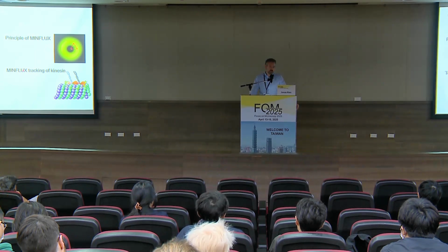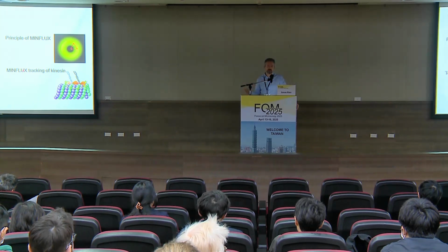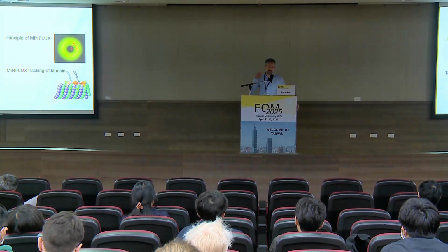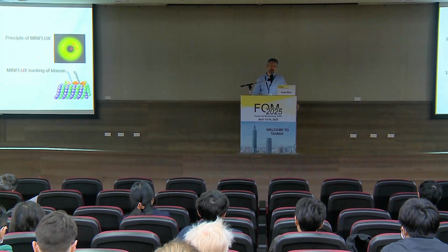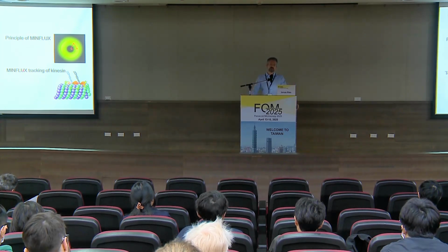Yeah, I think, well, you can try to reduce the flickering. If you don't work in living cells, often the buffer can be changed, or you use a different fluorophore that shows less flickering. And honestly, we didn't look at this experimentally. I think that's something the field has to do, to benchmark flickering on these timescales. The other way, of course, is you can average over many more fluorophores. So if you don't have to be super fast and need a time resolution of, let's say, 10 milliseconds, even with the Abberior instrument, you can average over 20 cycles to try to average out this flickering.